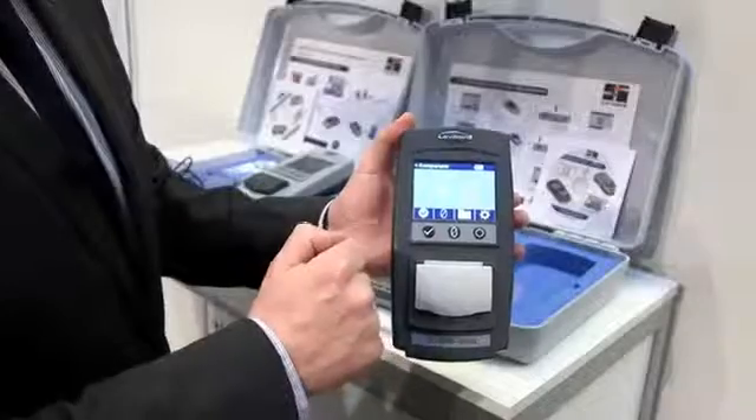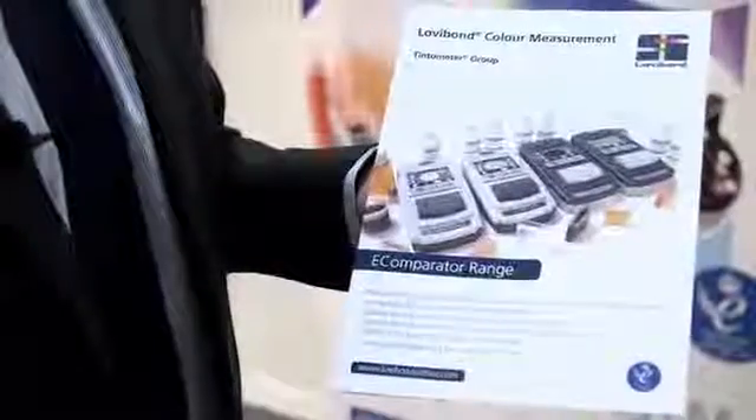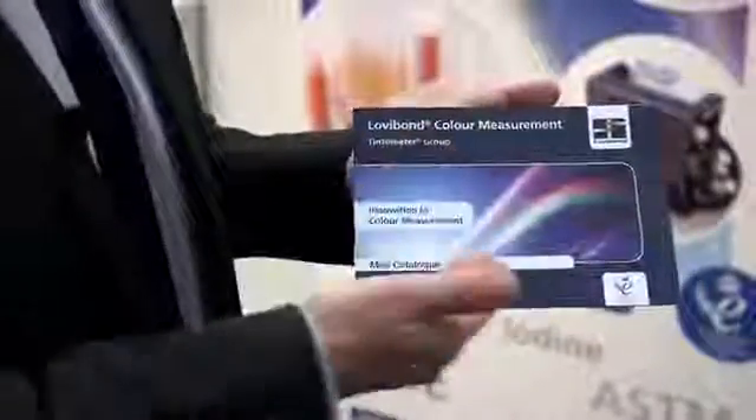For users who are used to a visual reading and not an electronic reading, they have the assurance that the on-screen colour is giving them what they're used to — a familiar interface, but you also have the electronic data. Once they're used to the unit, the numbers will become what they use in the lab to check compliance. For further information, visit our website at www.lovibond.com, or download literature from us summarising the eComparator and our mini catalogue, which takes you through the whole product range and explains the transition from visual to automatic units, with the comparators as a bridging product.